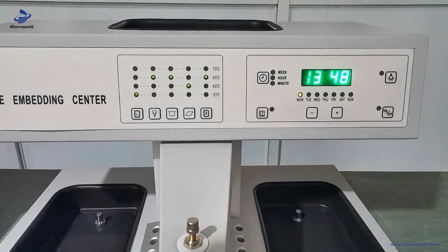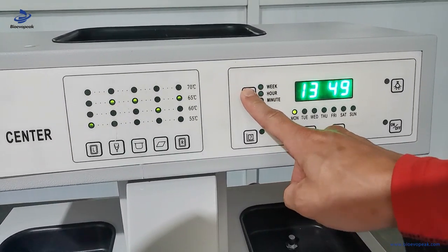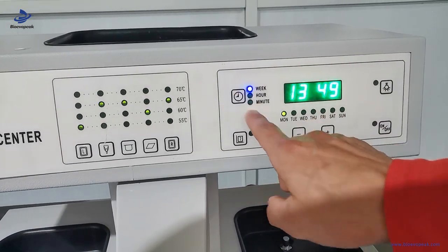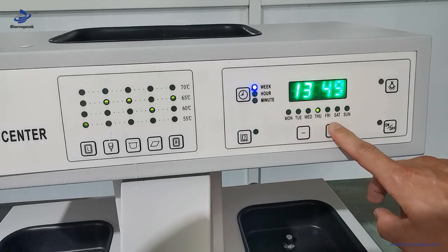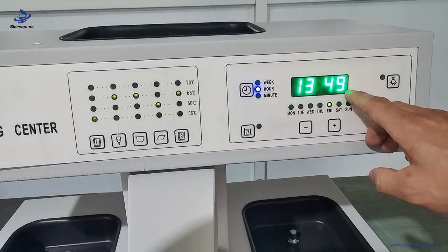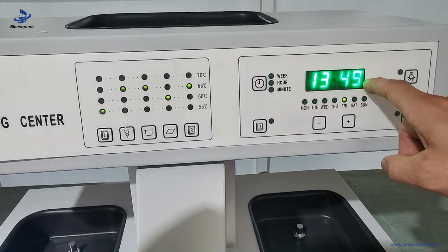Now the introduction of setting the current time. Firstly press this key for over three seconds and it shows the day of the week. For example, today is Friday. Then go to the hour — the time is 4:49. Then press two minutes, and finally press the time key again to confirm the current time.